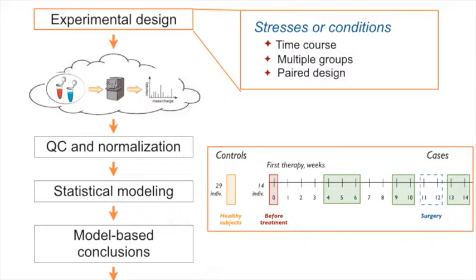Now for the disease subjects, they had plasma samples at diagnosis. Then they had some measurements during chemotherapy, and then some measurements after chemotherapy. I don't have space here, but they also had measurements after remission, sometime after they came back for a follow-up. So there's another time point much later in time here. And so here's the design. These are different people, right? So these are two different groups. One group just has one point, the other group has multiple time points.